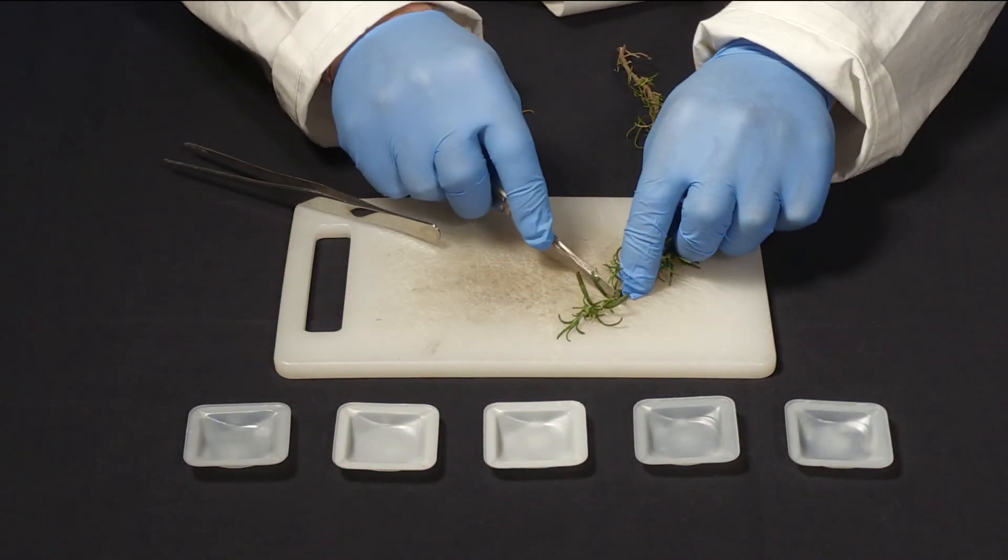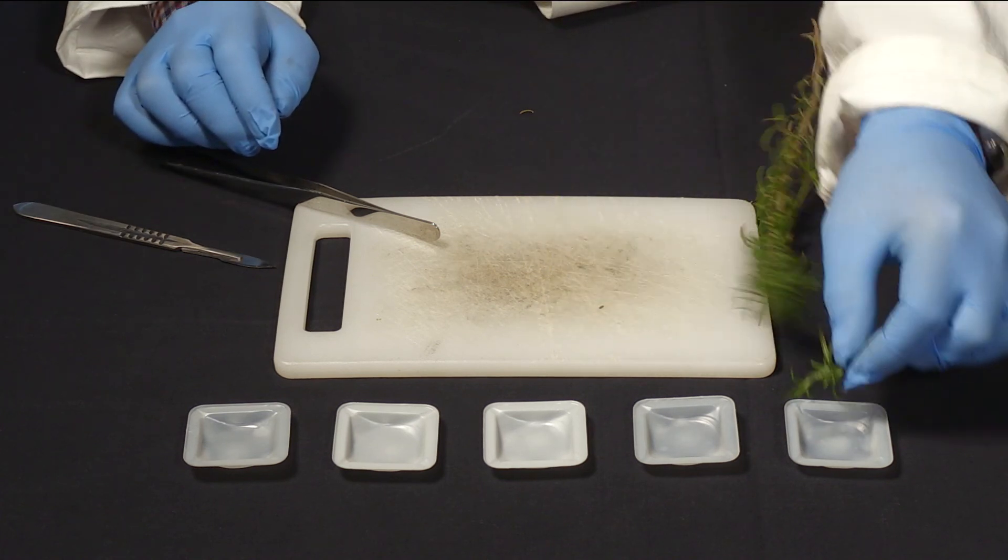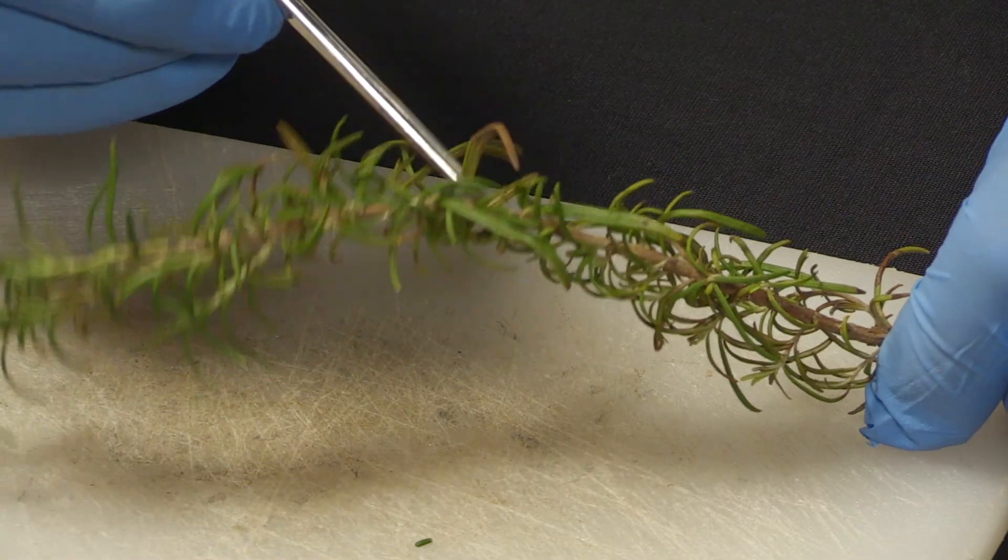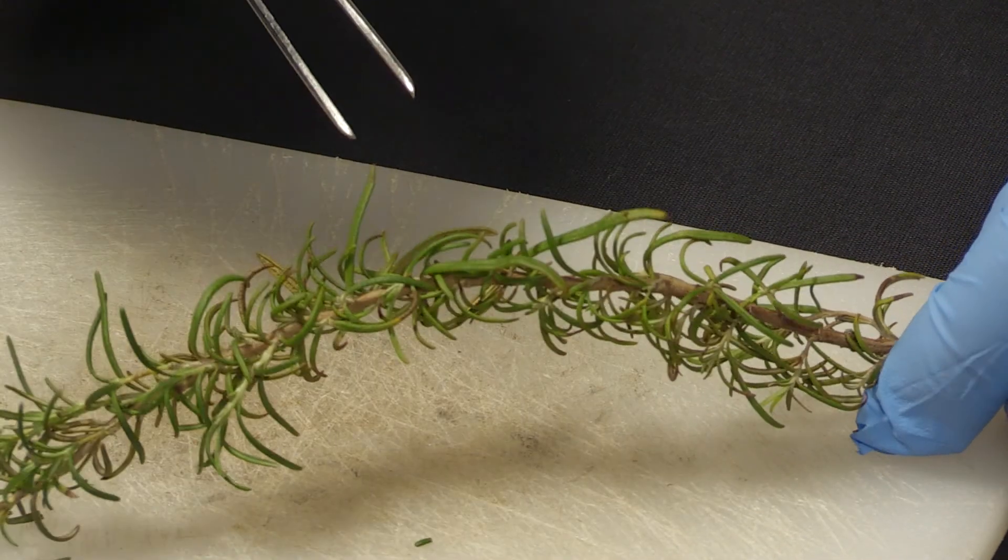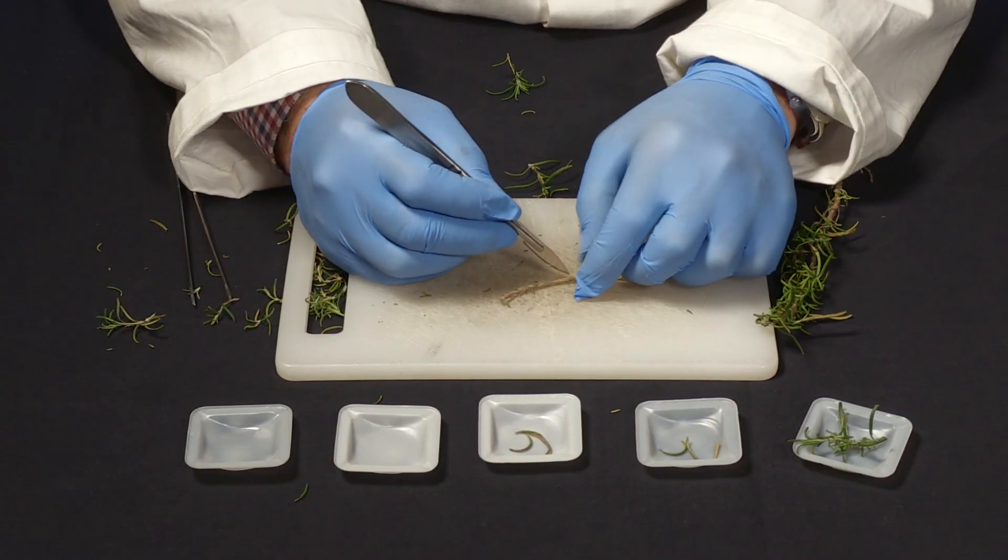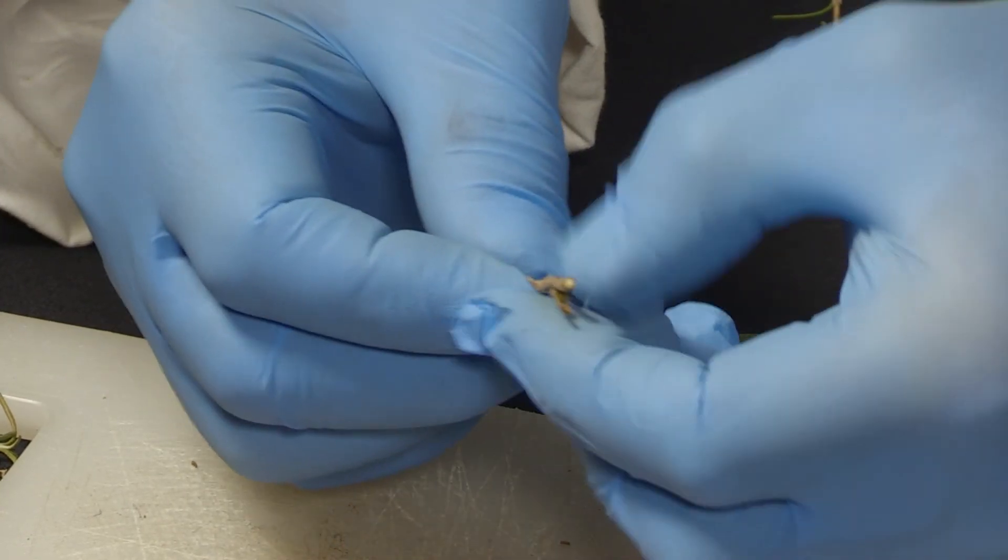Different plant tissues exhibit different chemical composition. Young tissues differ from mature ones and healthy parts of the plant differ from damaged ones. For these reasons, collected material must be carefully divided and separately analyzed.